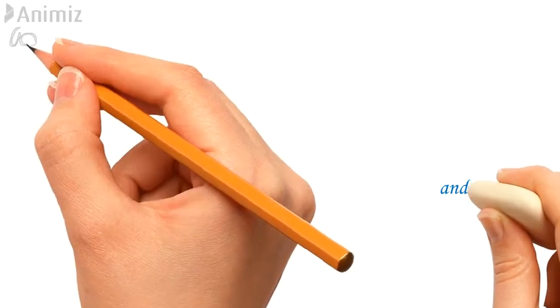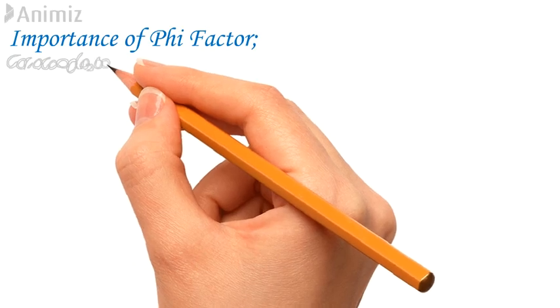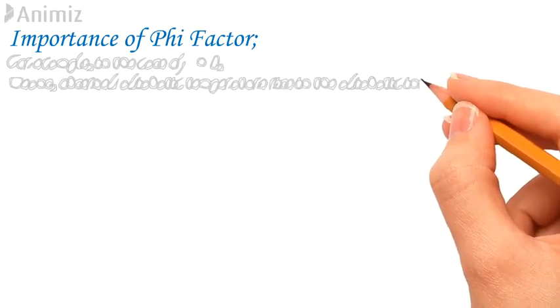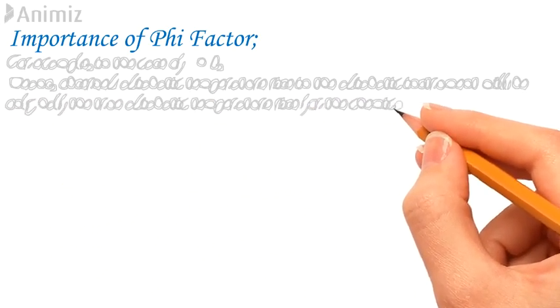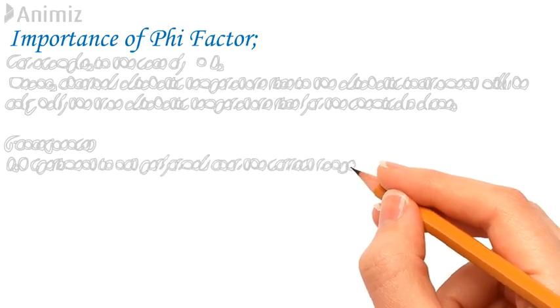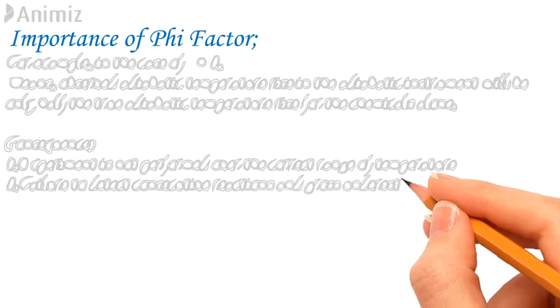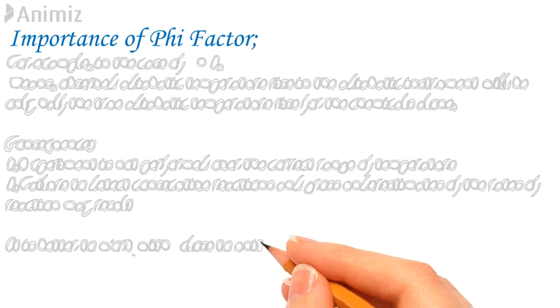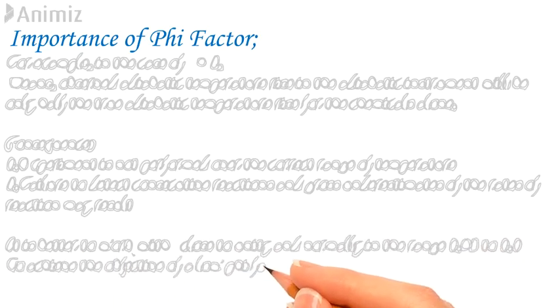Importance of phi factor. Suppose in adiabatic calorimetry phi factor is 2. It means that the observed adiabatic temperature rise in the adiabatic instrument will be only half of the true adiabatic temperature rise for the chemical alone. Its consequences are: first, the experiment is not performed over the correct range of temperature, and second, failure to detect consecutive reactions and gross underestimate of the rate of reaction may result.